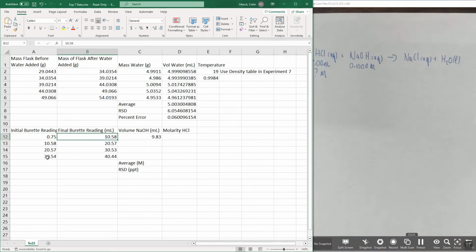Note that for different titrations, that's a different value, okay? 35 sometimes is way too low to start a titration, because if the titration takes 35 milliliters and you only have 15 milliliters in there, you're not going to be able to do it. Because if you're at 35, you only have about 15 left, because it goes to 50, sorry. So it's not a one size fits all, that always if you have more than 35 milliliters, you're good. It's just in this case, since it takes about 10, if you have about 35, you're good.